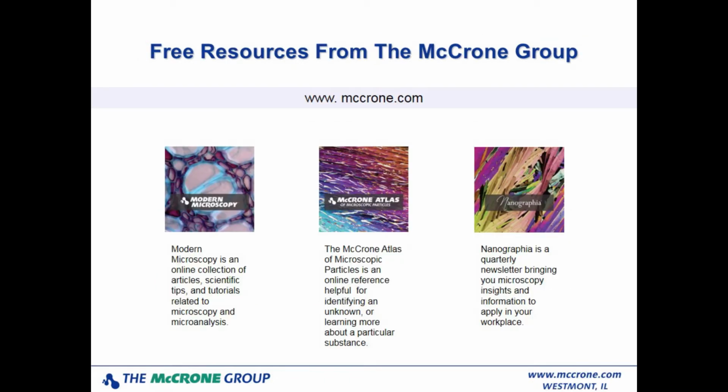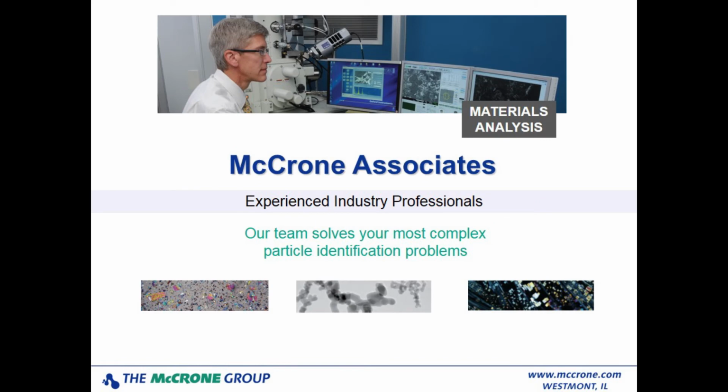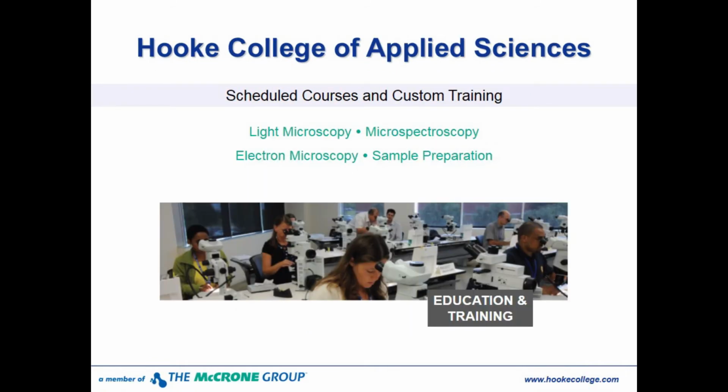Yeah, Chuck wants to know, not me, but one of the attendees here, how much is PLM used as an early step in the investigation? That's an excellent question. If you've followed any of my work in the past that I've published, when I've published that identification strategy, you'll find that sometimes I substitute the IR microscope for the PLM. And that's because a good number of the people that I worked with within GlaxoSmithKline, which is where I was at, were much more comfortable using the microspectroscopy than they were using PLM.